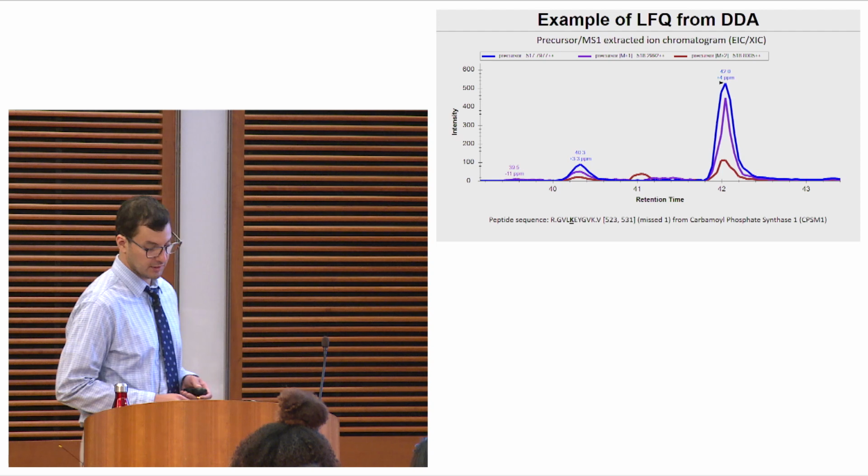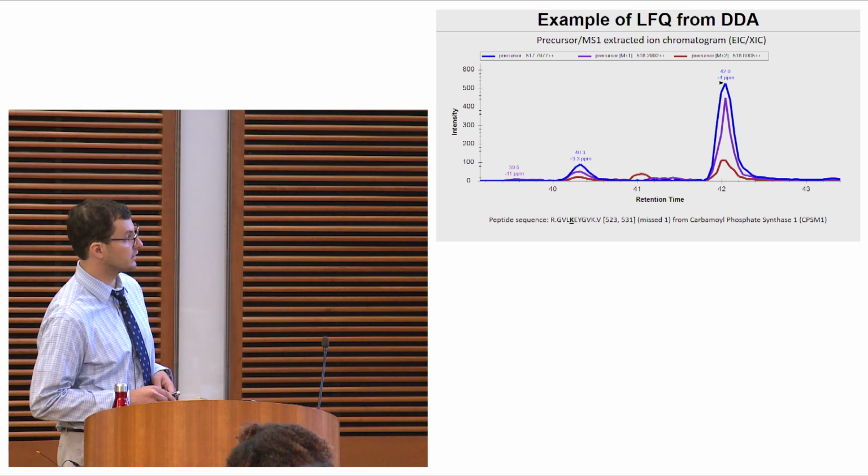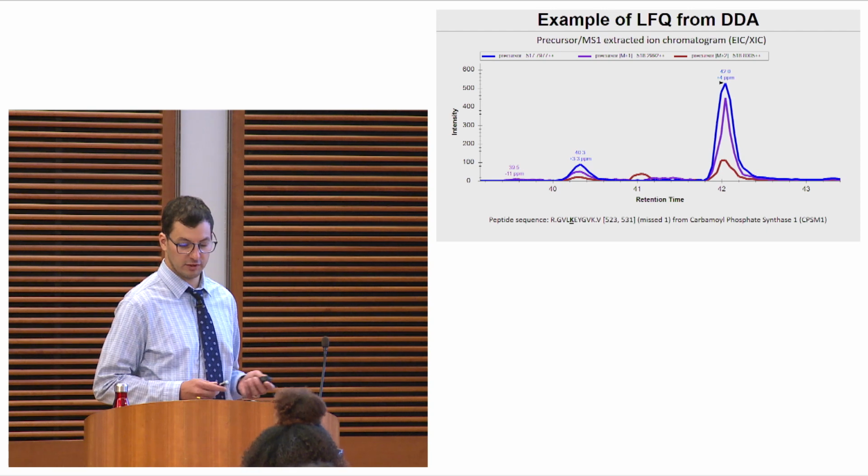But you'll also notice that there's actually two peaks here that could be the correct peak. There's one at 40 minutes and one at 42 minutes. So which one do we think is correct? How can we know which one is correct?